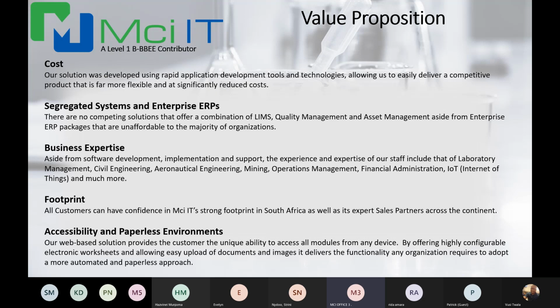I think the best way to explain that to potential customers is that your financial system or your quality management system can be down for a day or a week or so, and it's not going to hurt your operations. However, for laboratories, the LIMS system is their operations. So it's not good enough for laboratories to opt for enterprise ERP systems that have a LIMS module developed as a side module and nice to have, whereas LIMS is as much a core of our business as laboratories are. So it's a lot more dynamic, and can be much better suited to organizations out there.